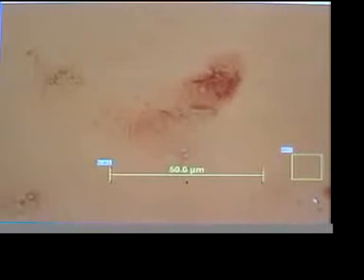This is live, in real time. I'll try to sharpen the focus a little bit for you. The scale is correct. This is about the 6th or 7th major reaction we've seen tonight.